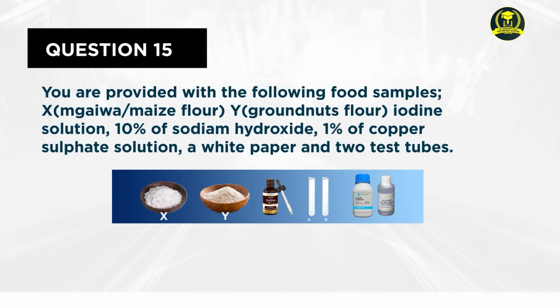Iodine solution, 10% sodium hydroxide solution, 1% copper sulfate solution, a white paper, and 2 test tubes.